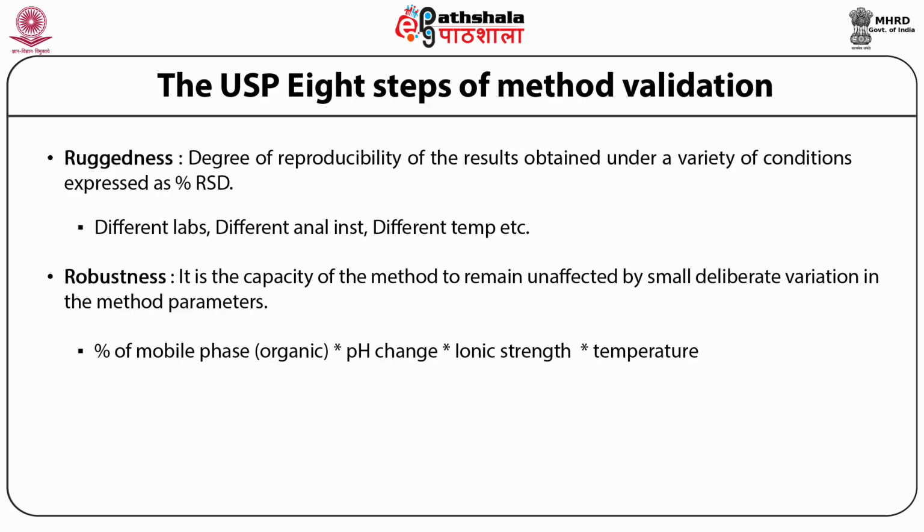So all these parameters need to be optimized when you are running an HPLC. In the overall exercise, we have seen system suitability parameters and method validation parameters to help you in HPLC analysis. And these are all the parameters which govern separations in HPLC.